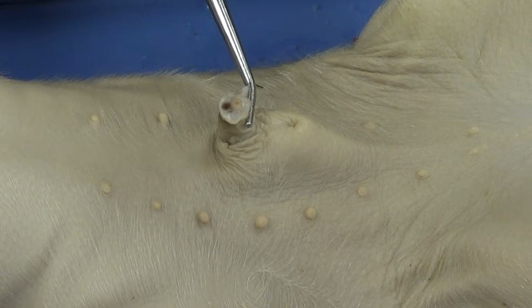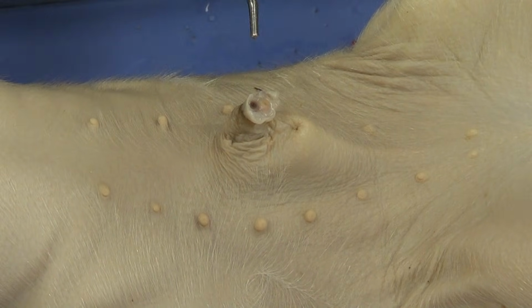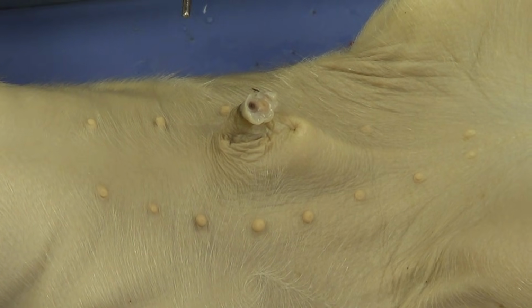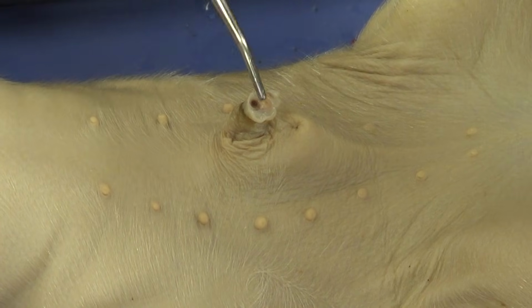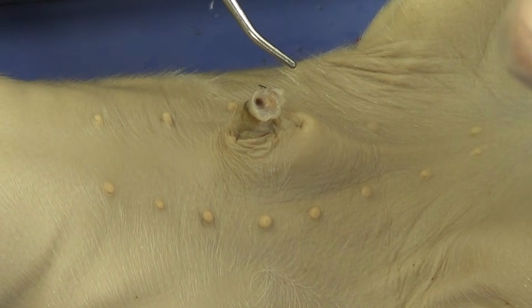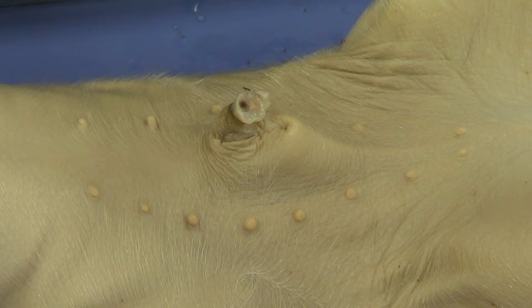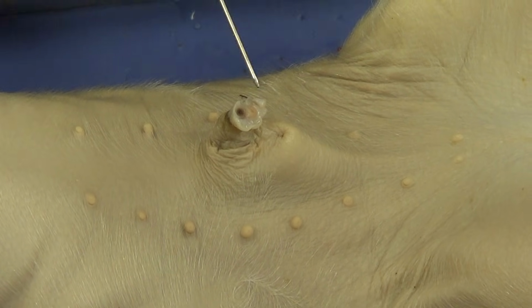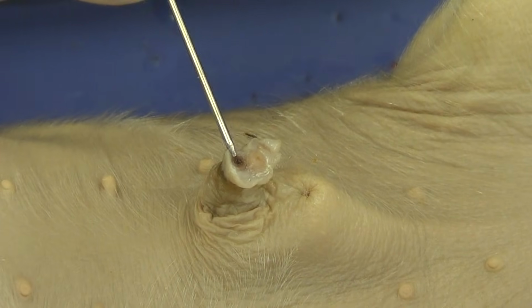Let's go and take a look at the umbilical cord. This cord has already been cut, but in many cases the cord will be longer. And what you need to do is pull the cord gently and take a scalpel and make a clean cut through that cord, as I've done here. Now, after you do that, you should begin to see 3 blood vessels. There's going to be 2 umbilical arteries and 1 umbilical vein.